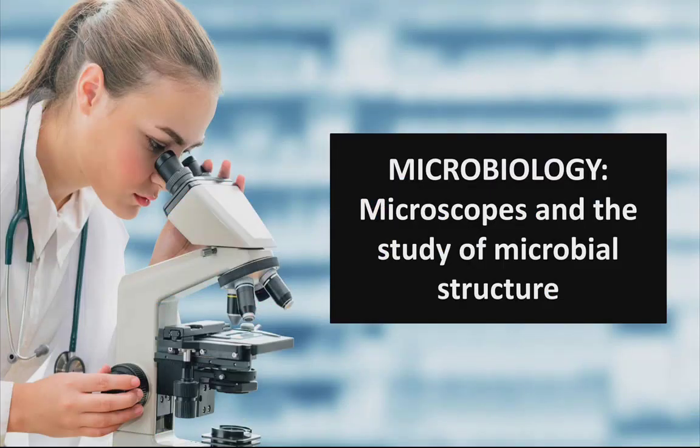So today in this lecture we are going to study lecture 2, that is Microscope and the study of microbial structure. This is a very important lecture of microbiology because in this lecture we will talk about what is a microscope, what are the functions of a microscope, different types of microscope, and at the end we will discuss some important questions that may be asked in the examination.